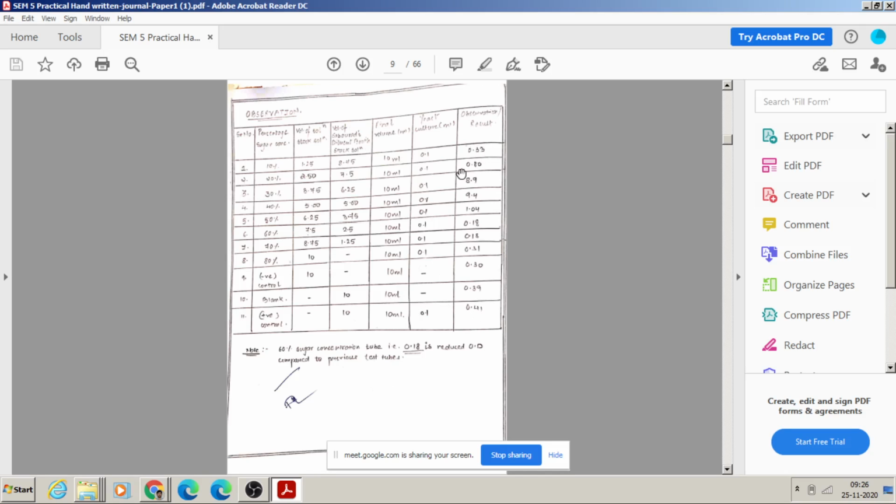Once the readings are obtained, from these readings we can conclude at what particular density, the optical density, it starts to get reduced, at a concentration of almost 50 or 60%, if I'm not wrong. So at 60% sucrose solution, that is the point where fungal activity is getting affected, and it doesn't show much significant growth. So this is referred to as the minimum inhibitory concentration. The point at which it begins, after that even at 70% it remains as it is. Okay, so that is 70%.